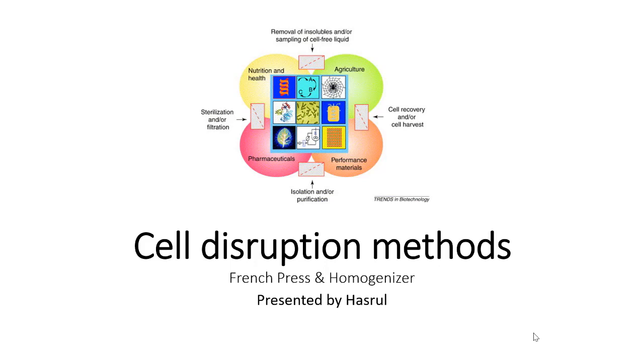Hello, Professor. In this opportunity, I want to give a short presentation about cell disruption methods, especially the French press and homogenizer.